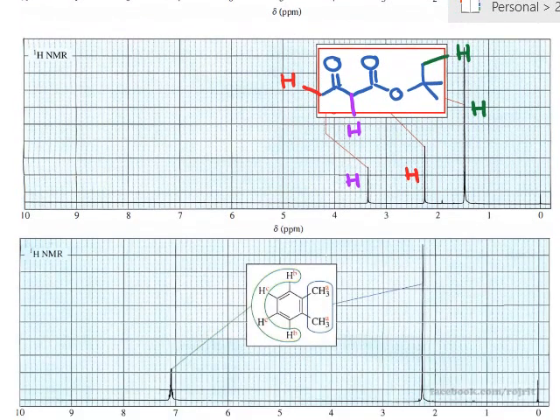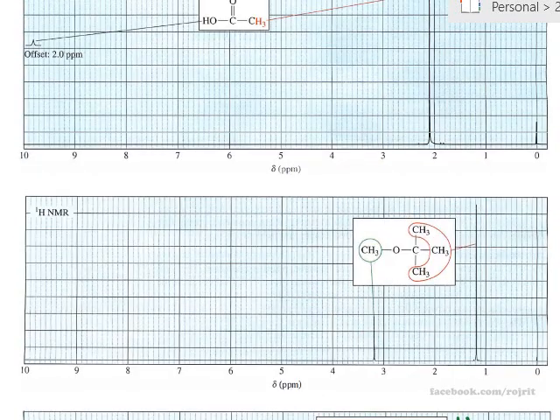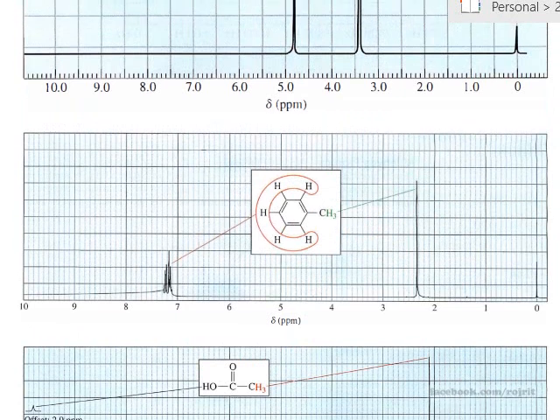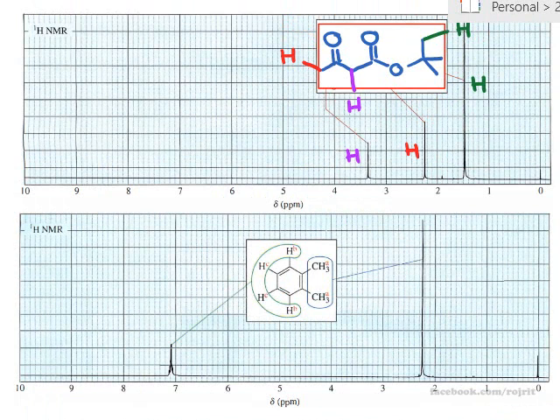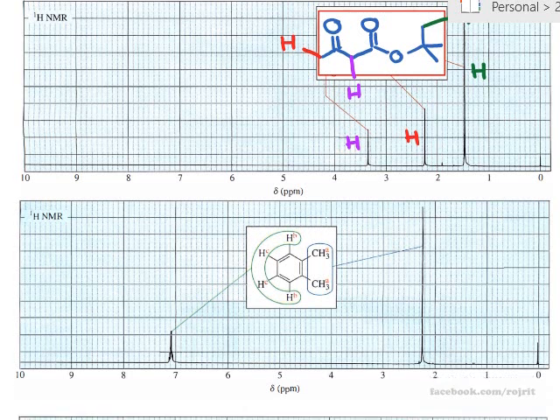And next, again, this is very similar to toluene, right? For toluene, you have 7 and 2, right? This is xylene. So again, your green color belongs to the benzene ring, and the blue color belongs to the methyl. So you have one carbon atom right in between the benzene ring and your hydrogen atom. So your hydrogen atom drops back down to the 2 ppm region. Right?